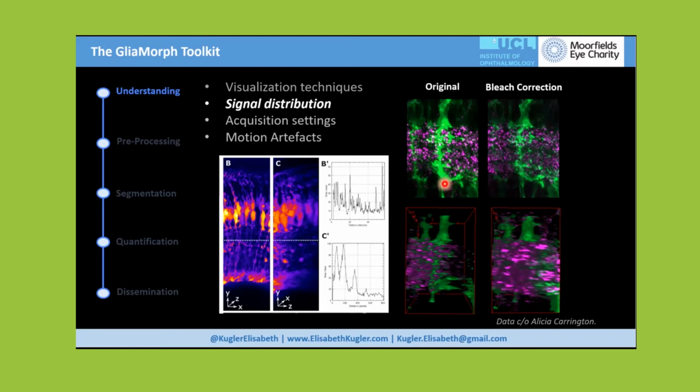And so this is really just to highlight that we're so used to looking at our images from one dimension, or from one direction, particularly when we image them in this direction, that it's really always worth not only looking at them in a 3D view, but also flipping them to the side and spending time looking at what any artifacts are, is there anything that we need to address in a computational or maybe experimental approach.